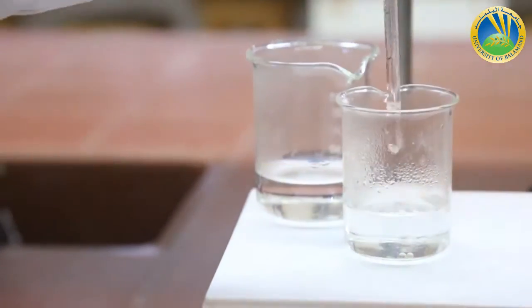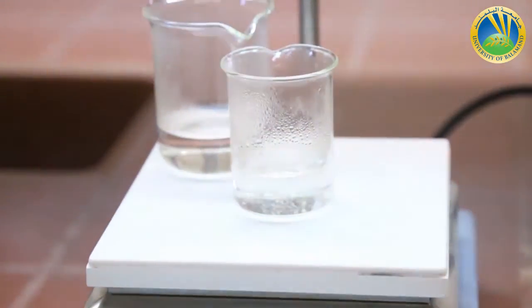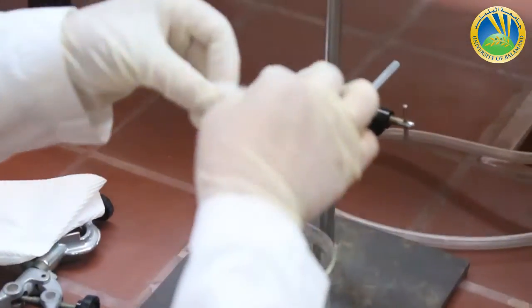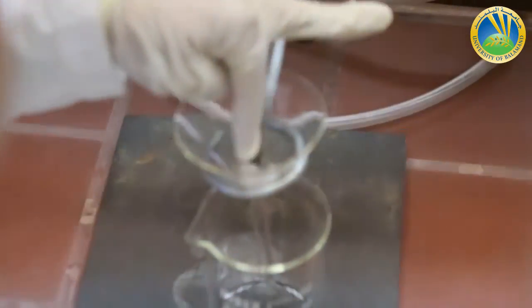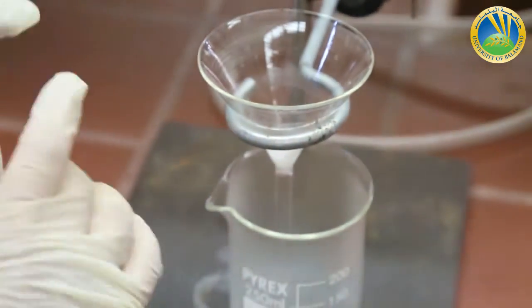That's why I have to bring a hot funnel from the oven and put a small piece of cotton inside and do the hot filtration. This is the hot funnel. I have to put it here and put inside a small piece of cotton to hold the impurities on. Okay, I have to be a little bit quick to do the hot filtration.